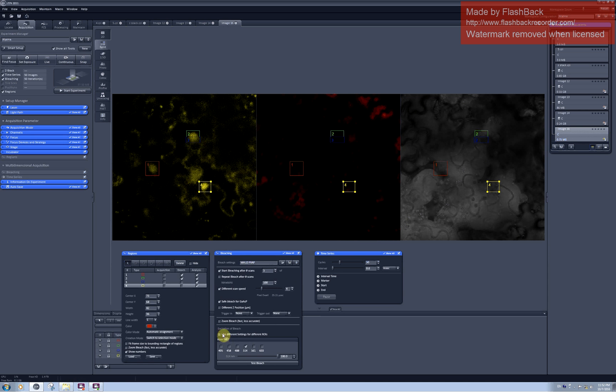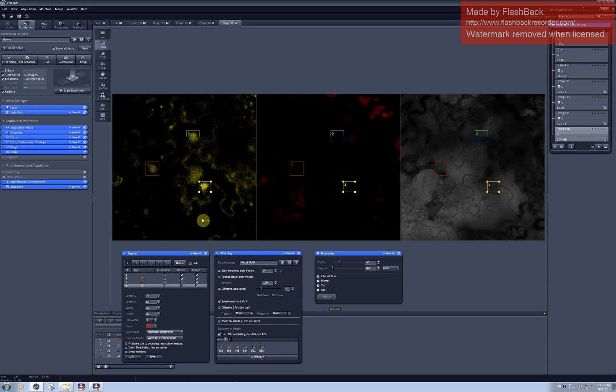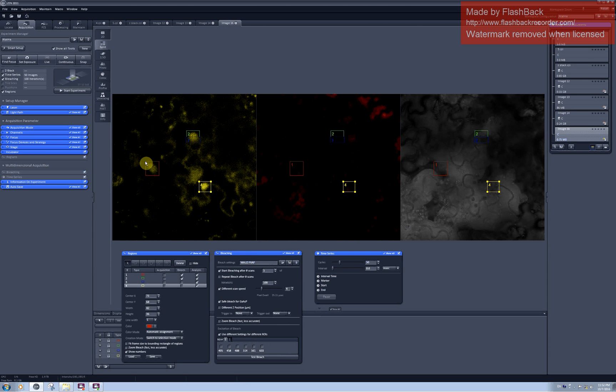Alternatively you can click here and use different laser lines for different selected areas. This would be useful if I had more than one fluorophore in my sample.